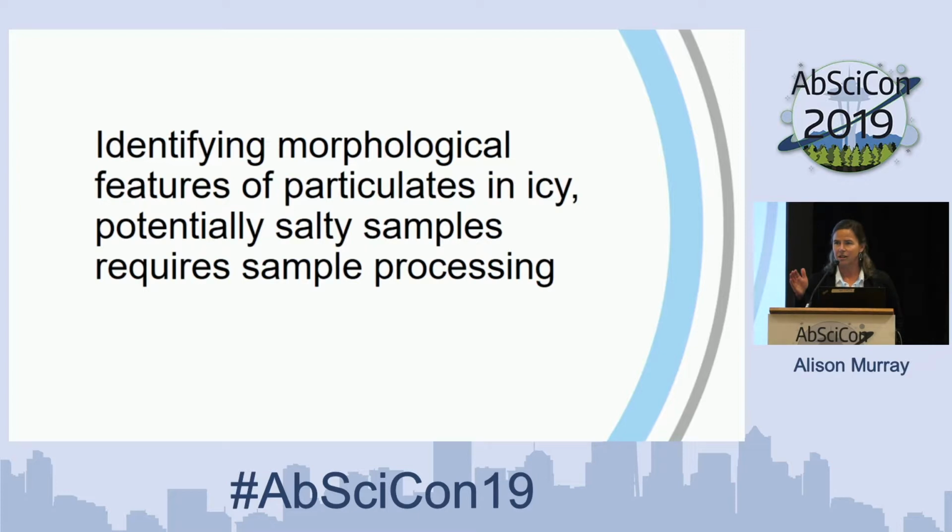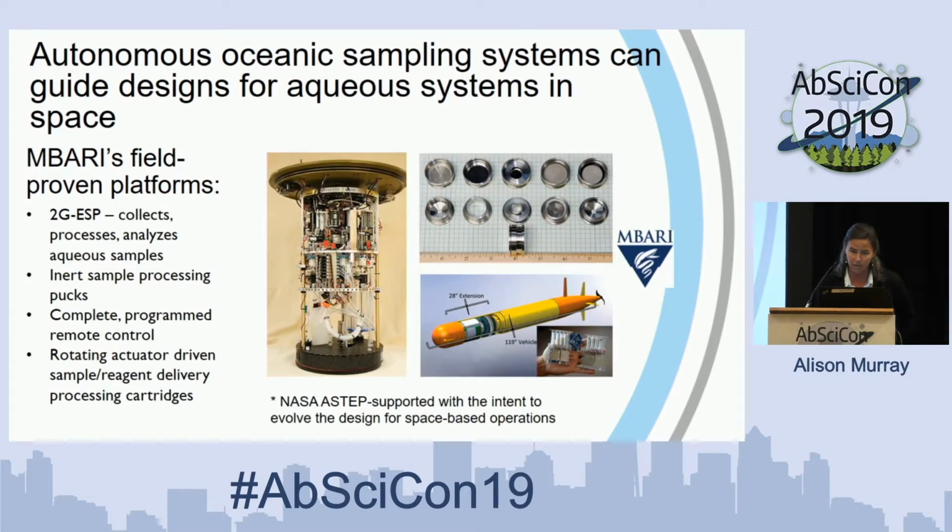As Peter talked about a little bit in his talk, identifying morphological features of particulates in icy, potentially salty samples is going to require sample processing. And along these lines, we partnered with the Monterey Bay Aquarium Research Institute to develop a concept for this instrument, which would be a sample handling system.